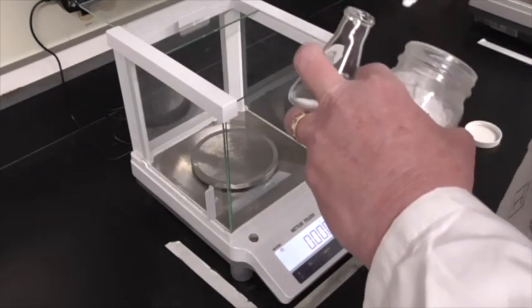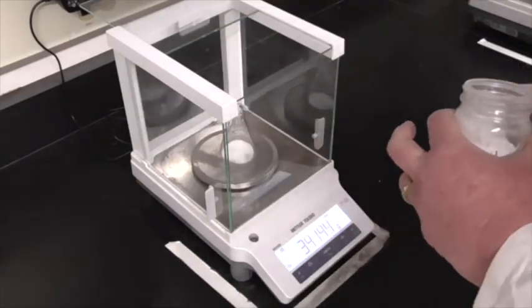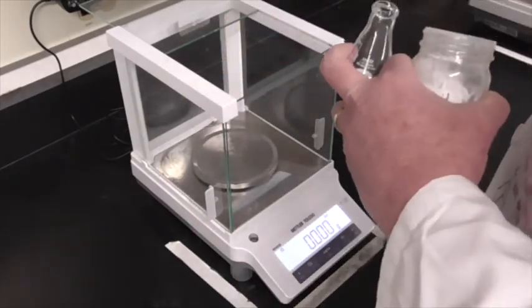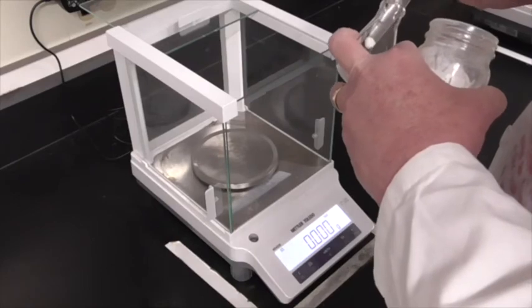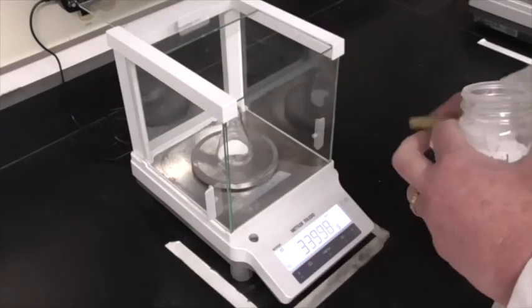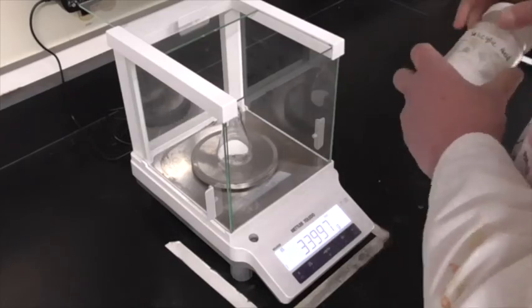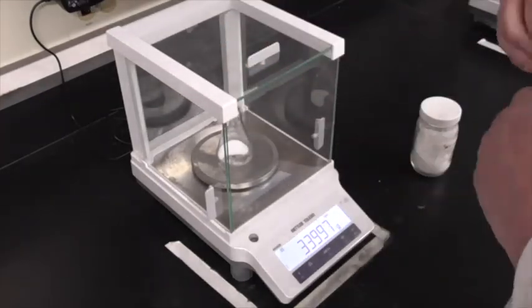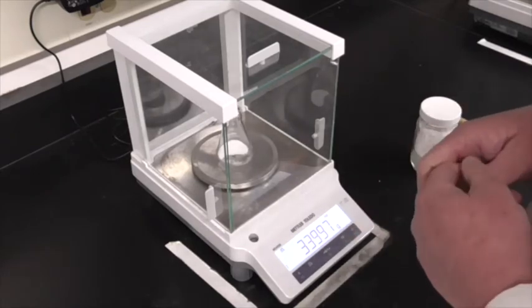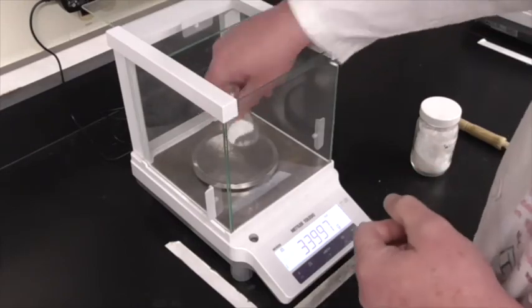So let's get rid of this. Went over 34 a little bit. Let's take just a little bit out. Nice, a little bit over 2, but that's fine. So the mass of our flask and the salicylic acid is 33.997 grams. Okay, now we're going to add the acetic anhydride.